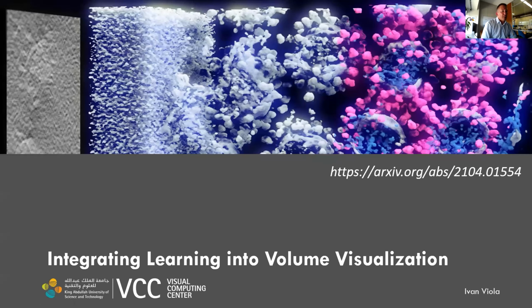And this brings me to the last part. We have been talking about electron microscopy, tomography, and how we can create the volumes. And the volumes are eventually used, in our case, for 3D volume visualization. If we do not perform a good reconstruction before, then the more noisy the visualization will be.